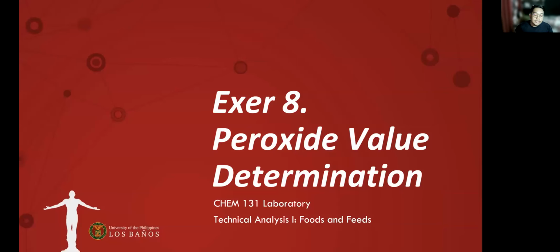So good day again. This will be the pre-lab discussion for Exer 8, which is your peroxide value determination as part of your exercises for your Chem 131 laboratory. So first, let's determine the types of rancidity as mentioned before.